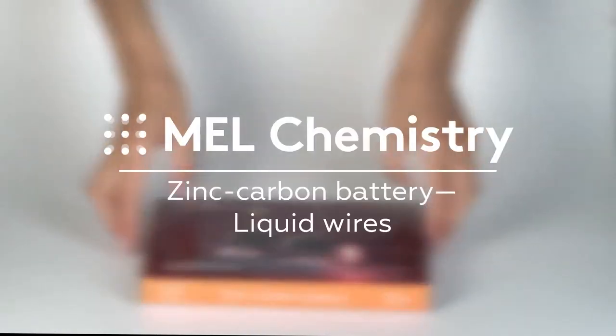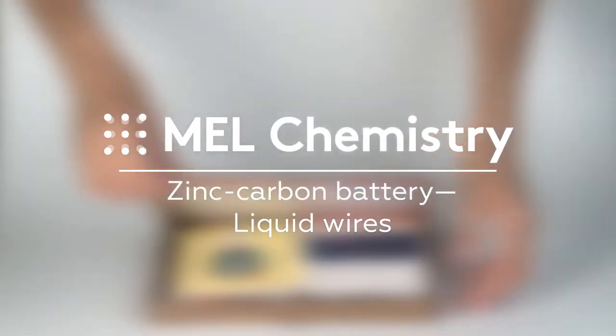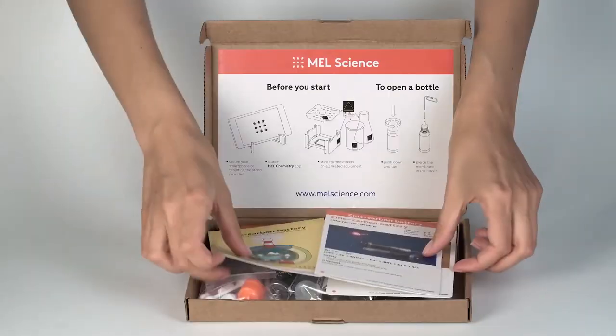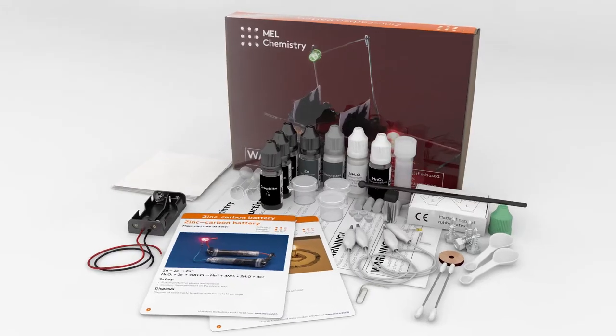Welcome to the wonderful world of chemistry. Today, with the help of the zinc carbon battery from Mel Chemistry, we will draw wires and see how they conduct electricity.